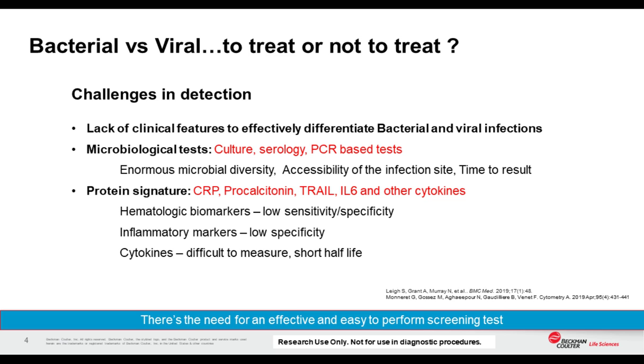Current protein and immunological tests like CRP, procalcitonin, and cytokines have low sensitivity and specificity. Thus, there is a need for an effective, rapid, and easy screening test.